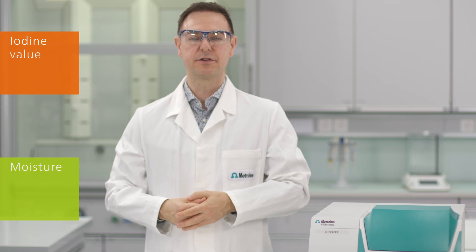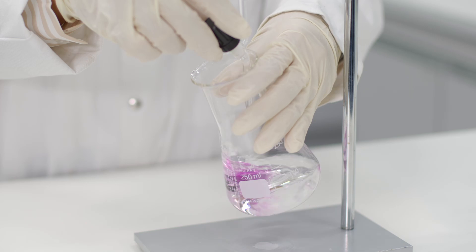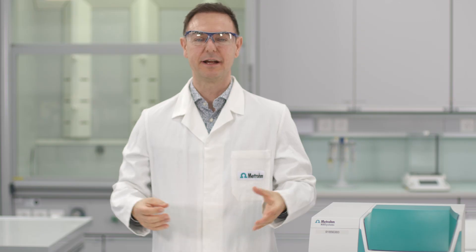The determination of iodine value, moisture, and free fatty acid content in palm oil requires different time-consuming methods. With near-infrared spectroscopy, you can analyze these parameters simultaneously in less than one minute without any sample preparation.